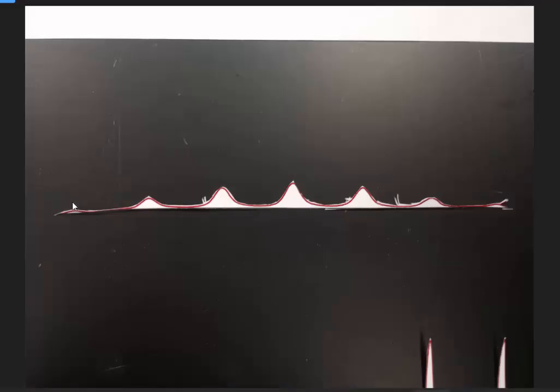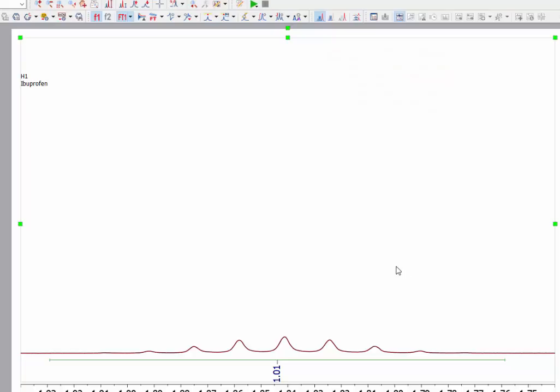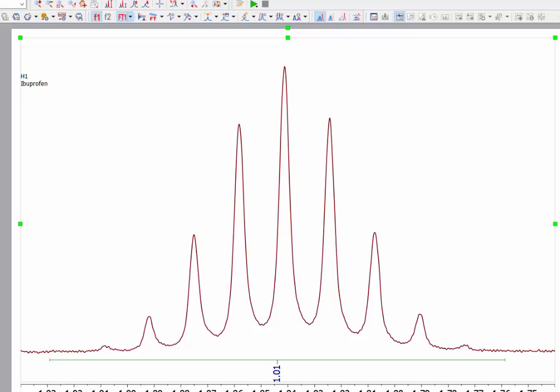Likewise with this peak, which appears to be a septet when I cut it out, because you cannot distinguish the nonet part from the baseline unless you increase the intensity dramatically. So if you look at this on screen, it's an actual nonet. Here is the peak as printed. Here is the peak when zoomed in high enough.